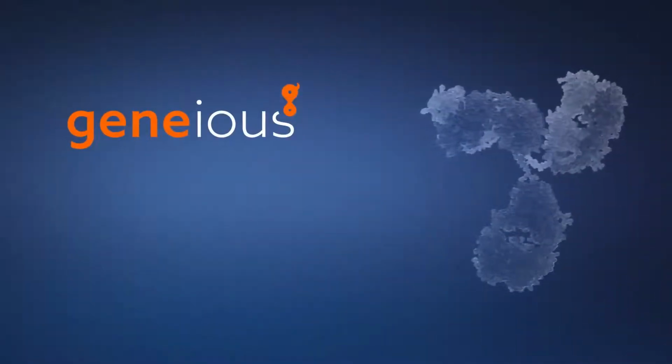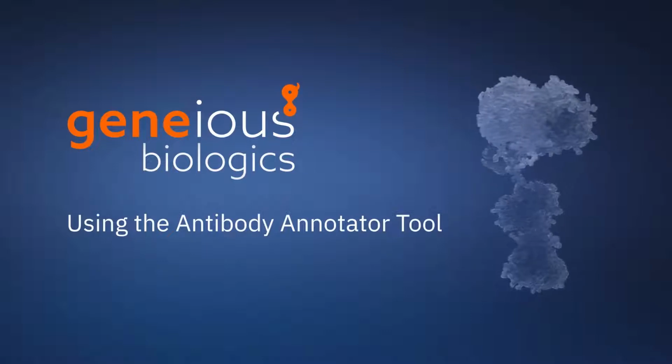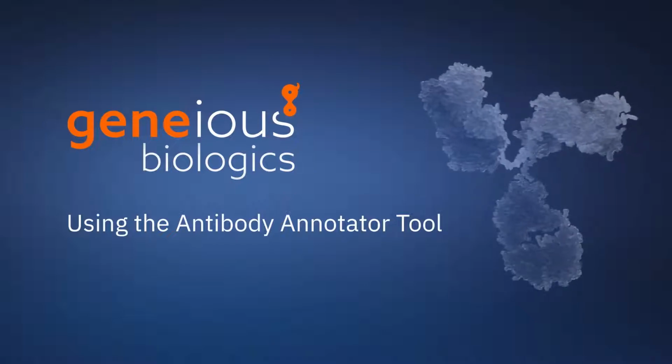Welcome to this Geneious Biologics tutorial video on antibody annotation. You can use the Annotator tool to annotate regions of interest, identify and annotate germline gene differences and liabilities on your sequences, as well as cluster sequences based on sequence similarity.